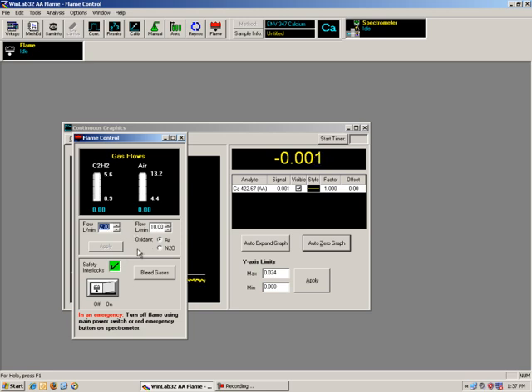These flow settings are all automatic. The oxidant is air, and with that we just hit the on position. Sometimes it takes a few times, and you can hear the gas flowing right now, and the flame was just lit. Usually you wait a second and you'll see indication that your gas and your air are flowing correctly, and they should stay at those same settings.